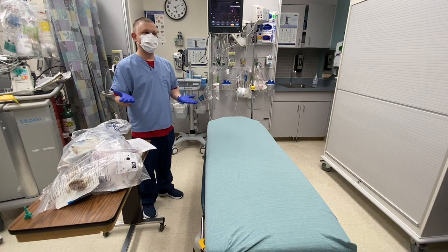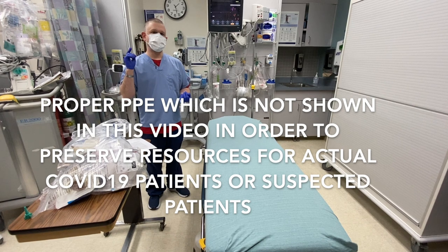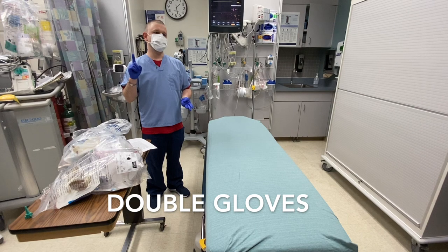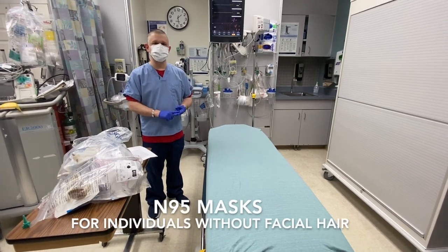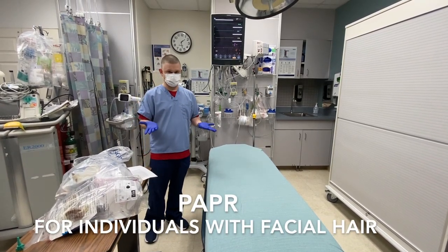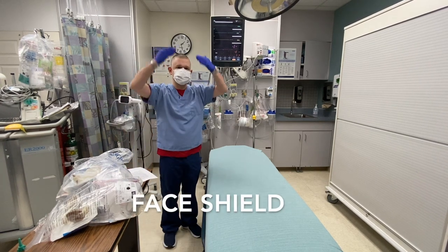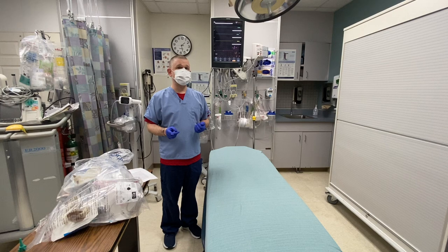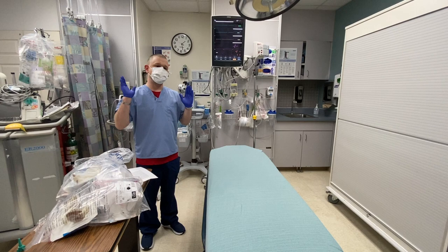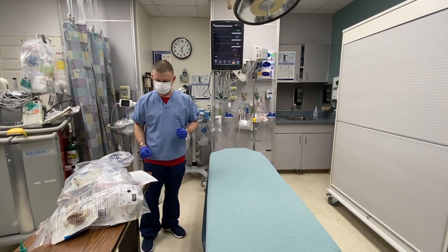Now, outside the room, you have to have your personal protective equipment. That is going to be a fluid-proof gown and double gloves. We are going to have an N95 mask if you do not have facial hair. If you have facial hair, then you're going to have to gear up with a PAPR. And then, of course, we're going to have our face shields as well. If you don't have a PAPR, you also have to have goggles that cover the eyes completely. Those things are going to be immediately available outside of the negative pressure room that the patient is in.